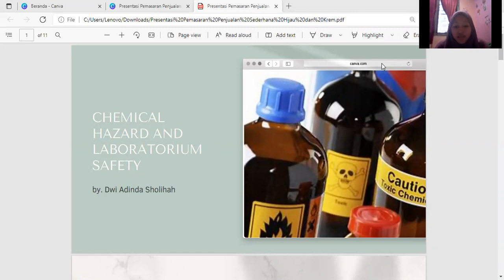So in this video, I will discuss hazardous chemicals, commonly abbreviated as B3, and laboratory safety.